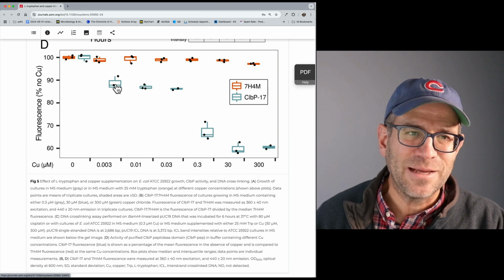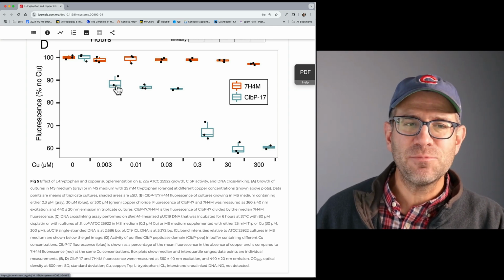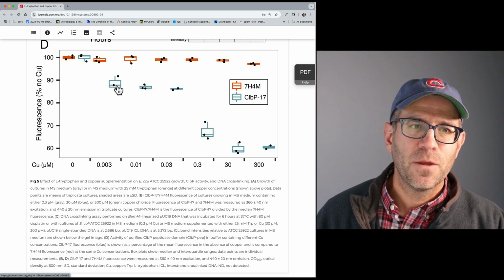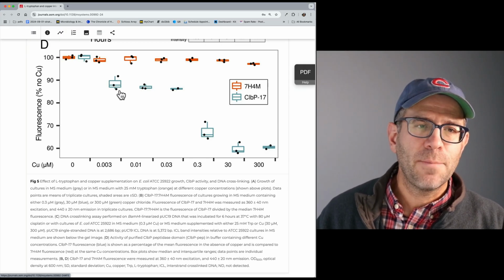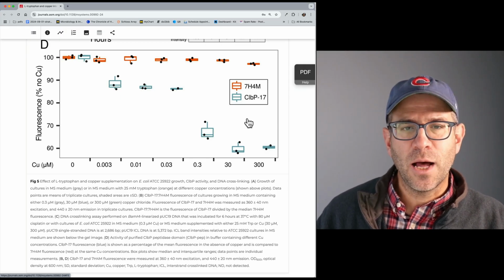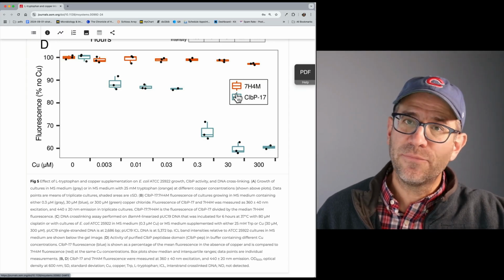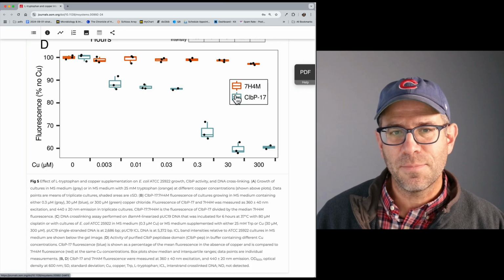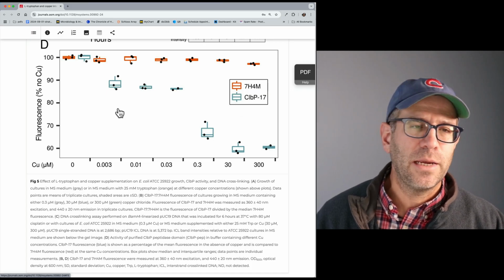Something that's interesting about this to me is that within ggplot2, we only have 2 color-related aesthetics, right? We have color, which when you think about a box plot, the color is the framing of the box plot, right? The min, the max, the median, the interquartile range.